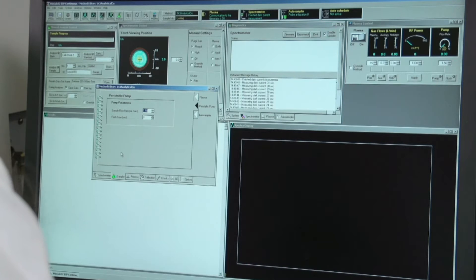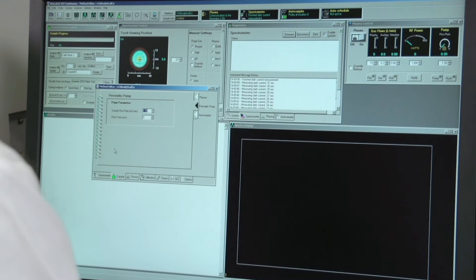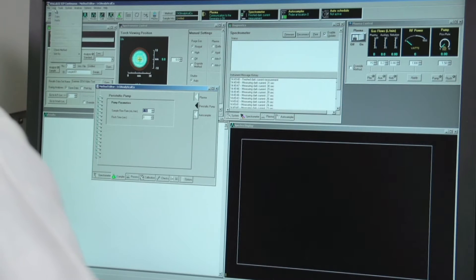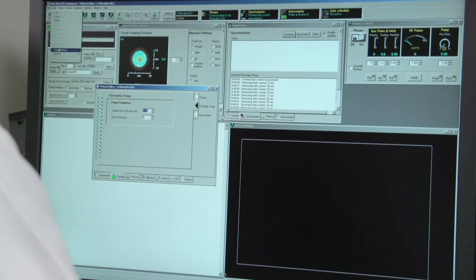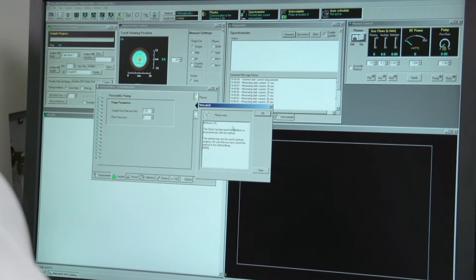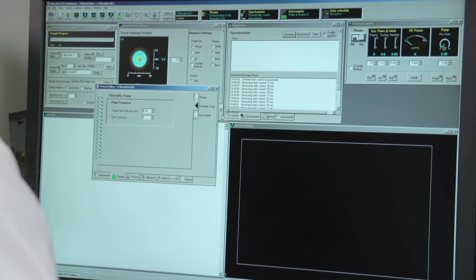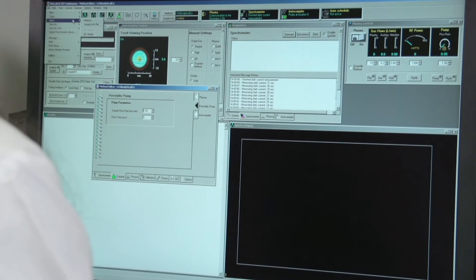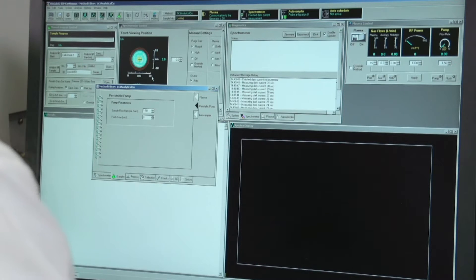Before running the sample, check the method to make sure it is sound. Go to Edit > Check Method. A window will pop up, and if your method is okay it will say so. Hit OK. Then save the method before moving forward by going to File > Save > Method.